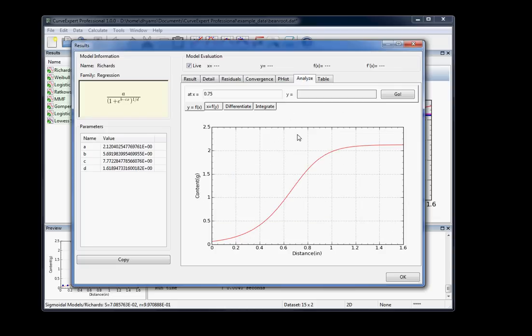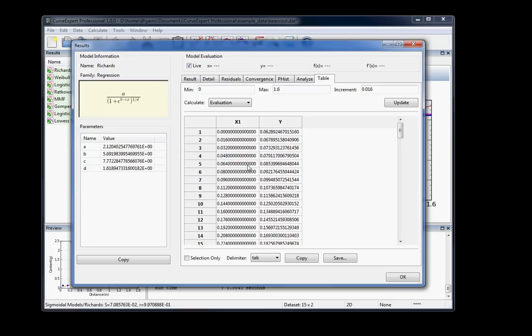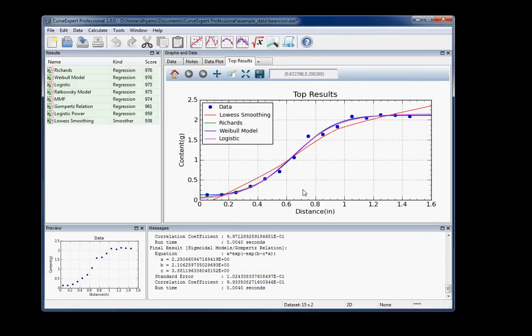And an Analyze dialog where you can do things like evaluate the function forwards and backwards, differentiate and integrate that function, and that's pretty much it for that. There's also a table generator. You can set limits on a table and generate a set of data that's associated with that result at whatever resolution that you require. So that's the result window.